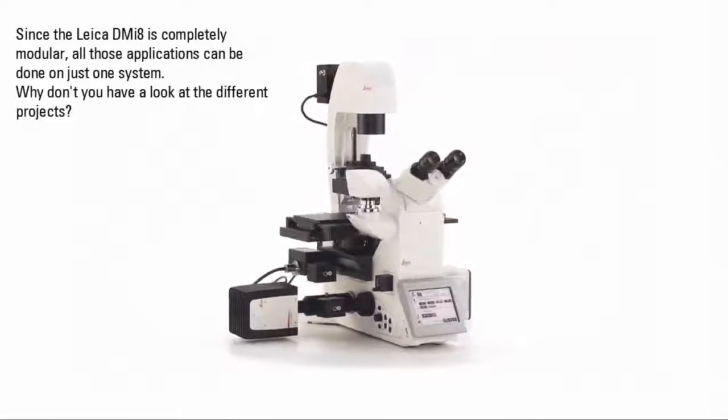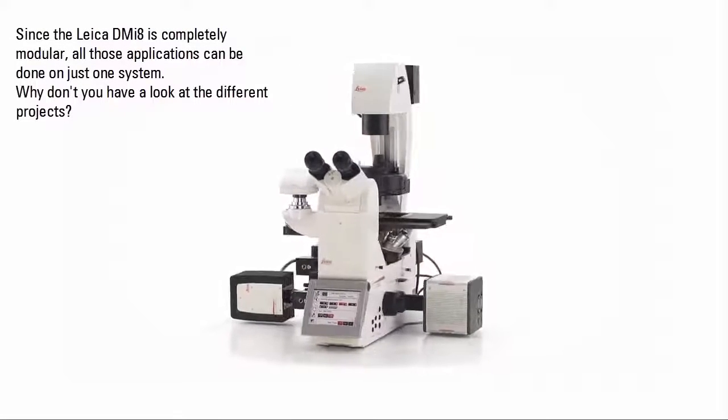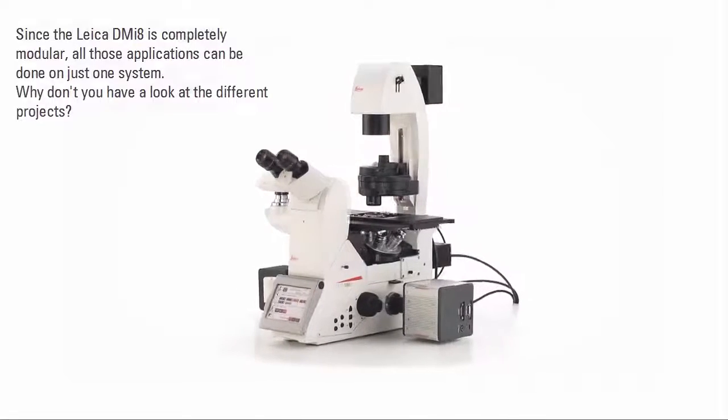Since the Leica DMI8 is completely modular, all those applications can be done on just one system. Why don't you have a look at the different projects?